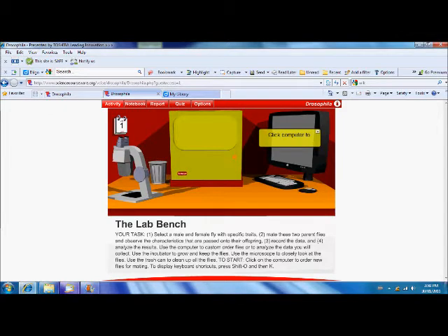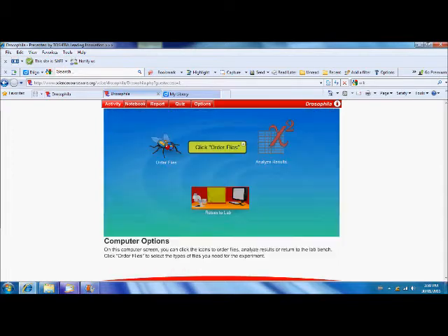Now, this website is an actual virtual lab and you'll have to follow the directions. So, let's quickly go through. First, what we have to do is click the computer to order our flies. Right here.